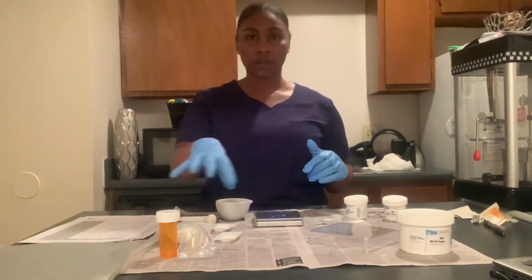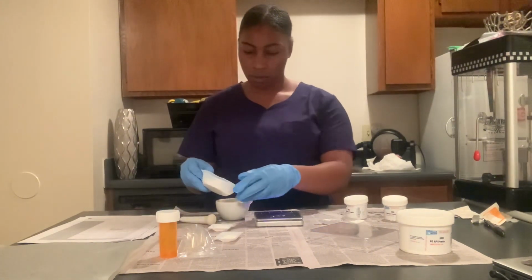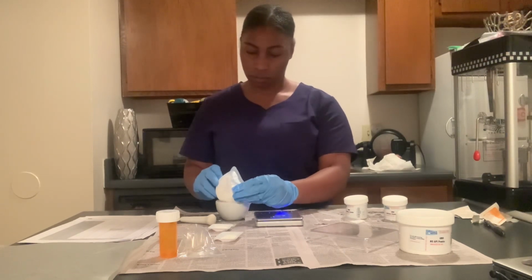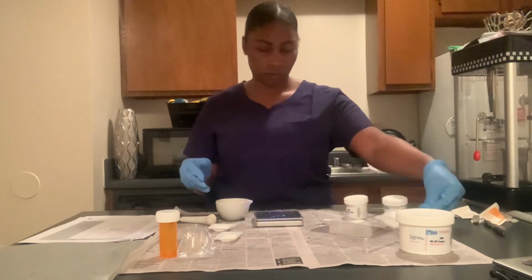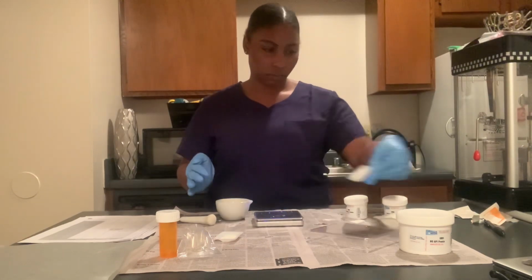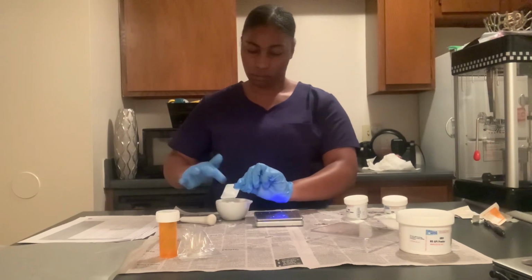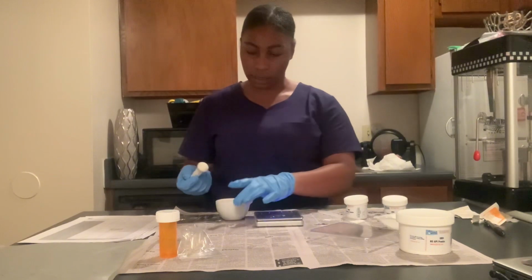So we're going to mix all of our ingredients together and put it inside our mortar. So now we begin mixing.